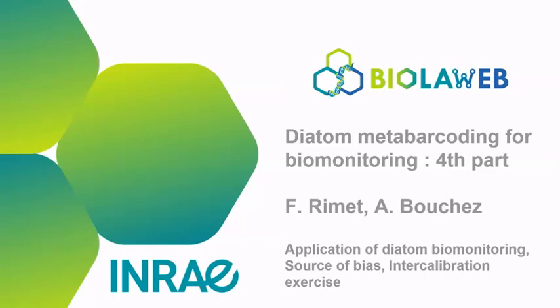May I give a comment? I think Kalman is totally right. When we count phytoplankton, we need to measure at least 20 or 30 specimens of each species to be able to calculate biovolume. Sometimes, when we have a good database from these sampling sites, maybe we can use the existing values and not measure each time.